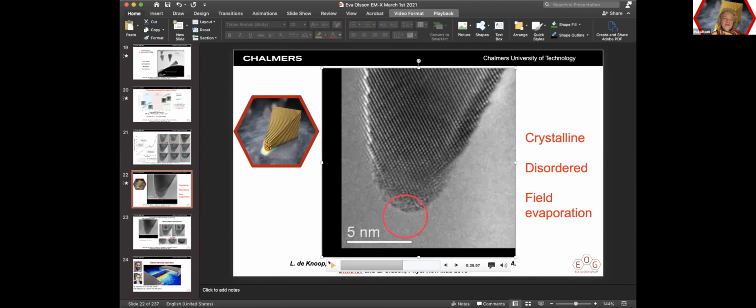And then the other experiment that we had in mind and that has not been carried out was that we wanted to put a TEM grid on the counter electrode to collect the gold atoms that were evaporated. So I cannot provide the answer today, but this is something that we really wish to carry out in the future. We wish to have that TEM grid, actually like a carbon film, to collect these gold atoms and then do the analysis on that grid, but we didn't have it yet.